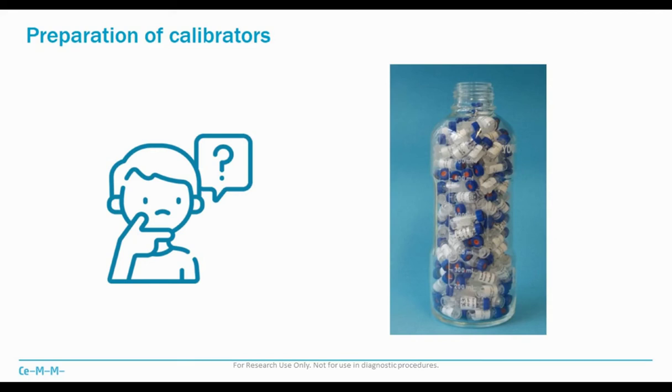So the one challenge is that if you would just dilute them in equal molar volumes, the highest concentration you would get would be around 250, 200 micromolar. And for some metabolites, it's completely fine, but for some, it's way too low. Some metabolites are at quite much higher concentrations in cell extracts. The other thing is solubility. How can we really mix these analytes that have different solubilities together?